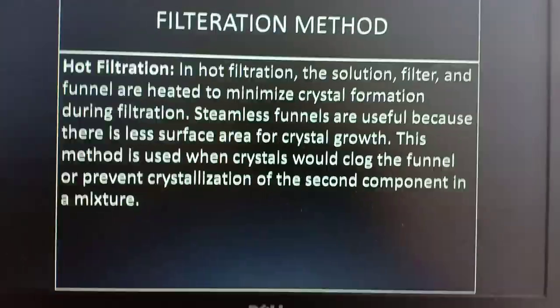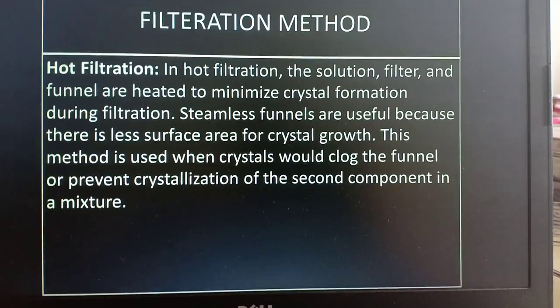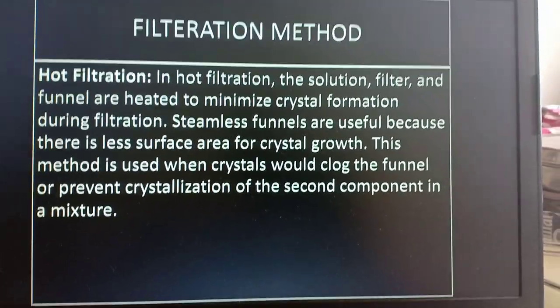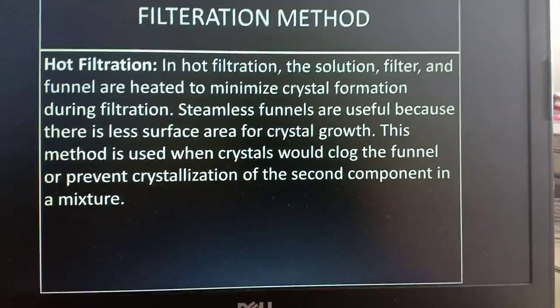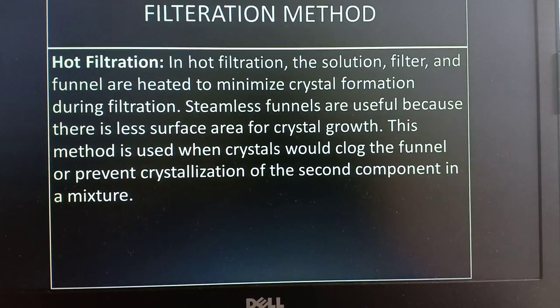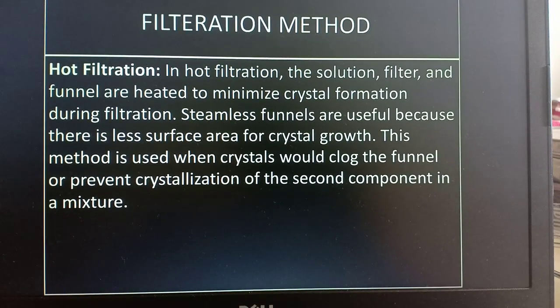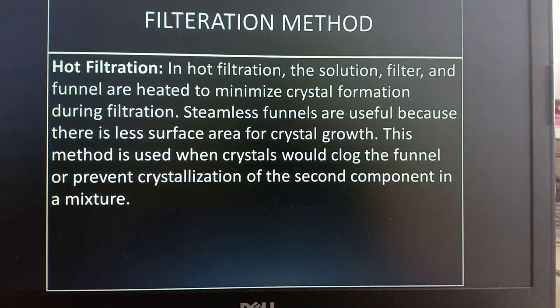Fourth is hot filtration. In hot filtration, the solution, filter and funnel are heated to minimize crystal formation. During filtration, stemless funnels are useful because there is less surface area for crystal growth. This method is used when crystals would clog the funnel or prevent crystallization of the second component in a mixture.